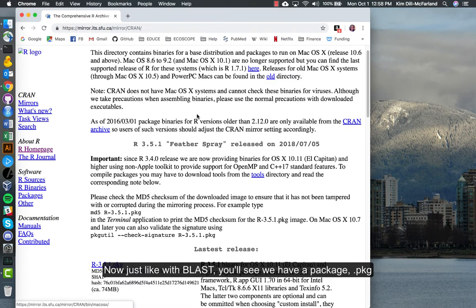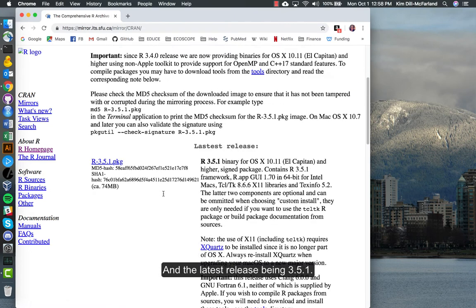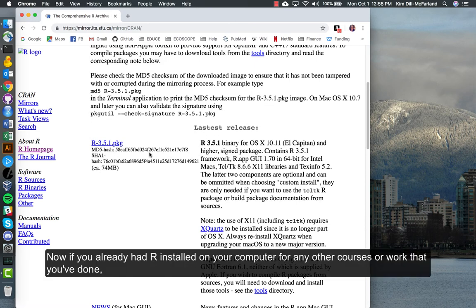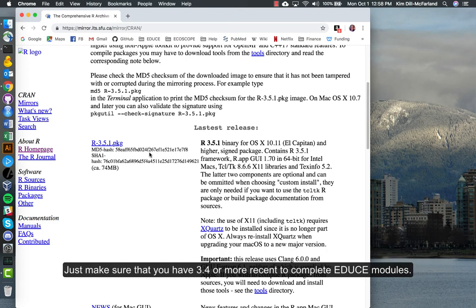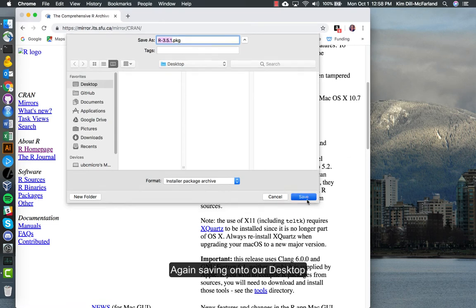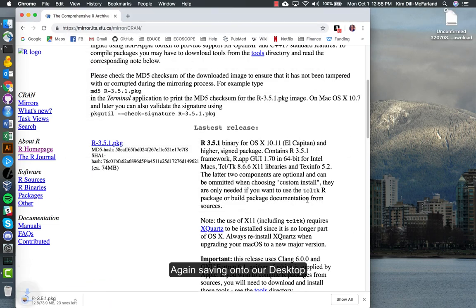Just like with BLAST, you see we have a package file pkg and the latest release being 3.5.1. Now if you already had R installed on your computer for any other courses or work that you've done, just make sure that you have 3.4 or more recent to complete EDUCE modules. Here we will install the most up-to-date. Again, saving onto our desktop.